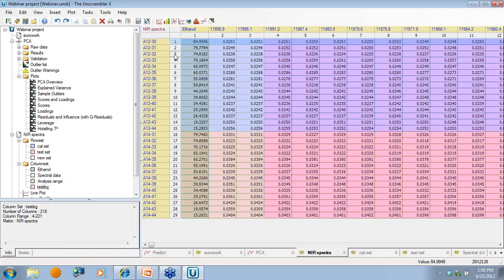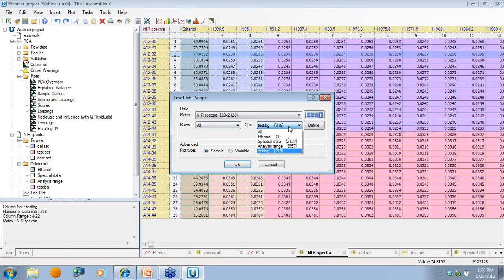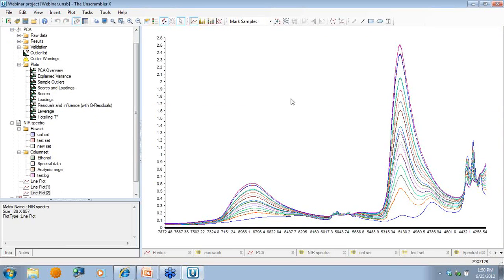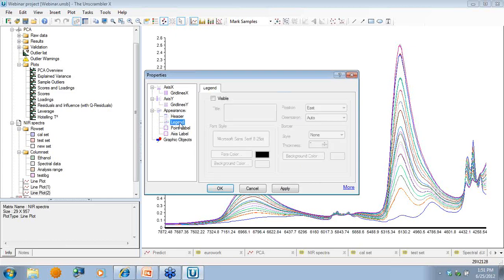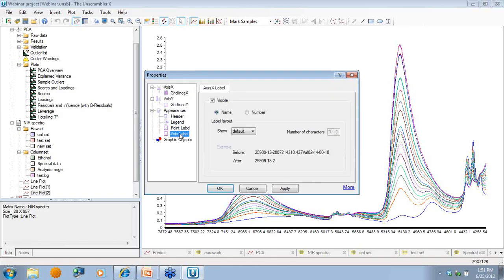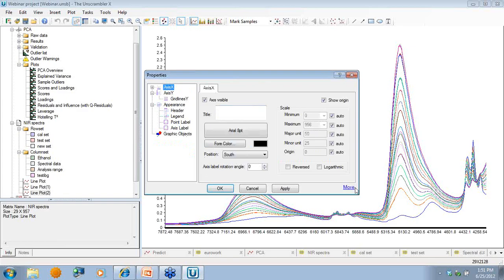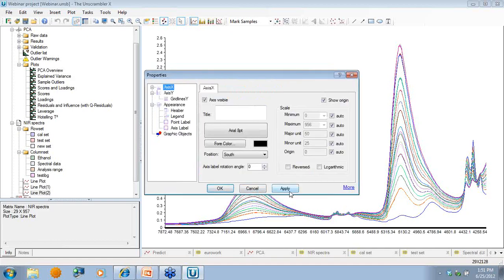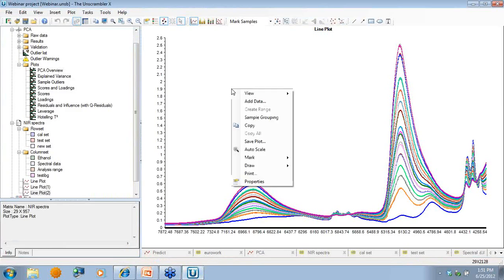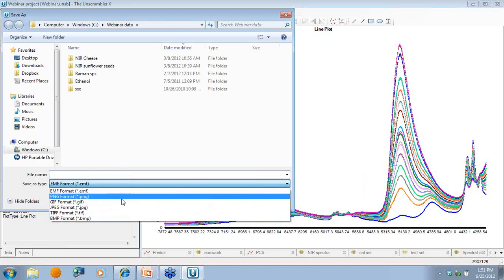To make plots of data, I select data and choose a line plot, selecting the analysis range as the columns to plot. The Plot Properties window allows customizing the plot — adding a header, legend, changing axis labels, font size, and further chart customizations. Once the desired plot is achieved, right-clicking allows copying, pasting, or saving in different graphical formats such as EMF or JPEG.